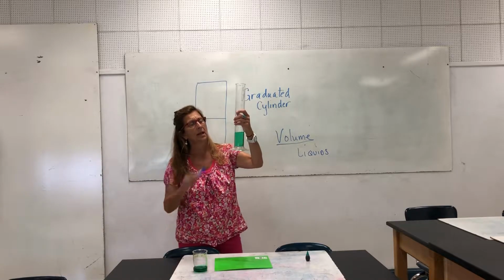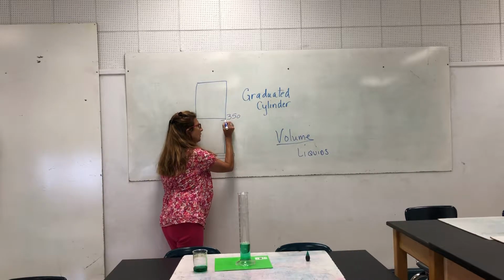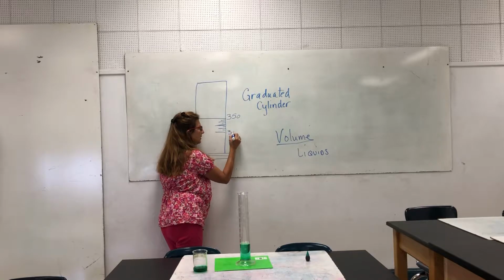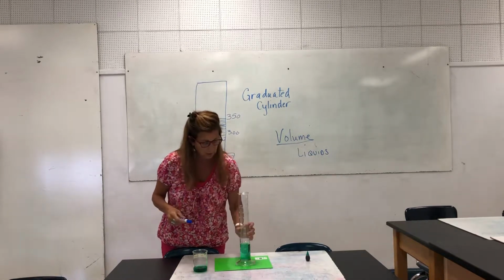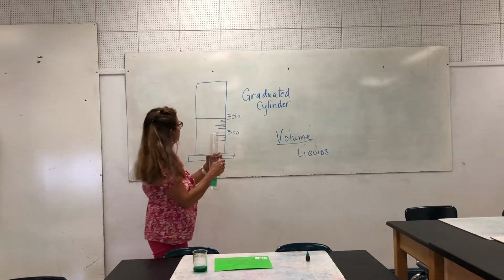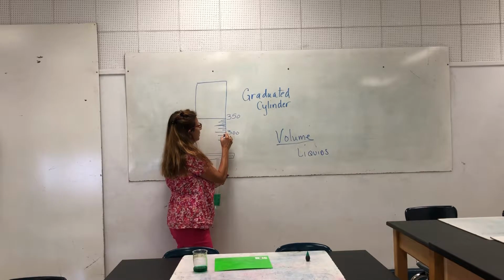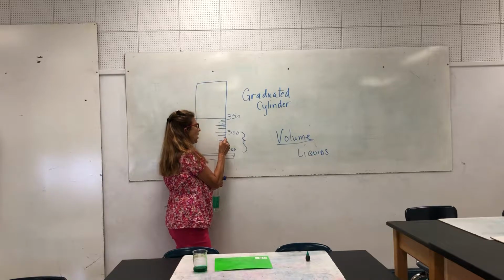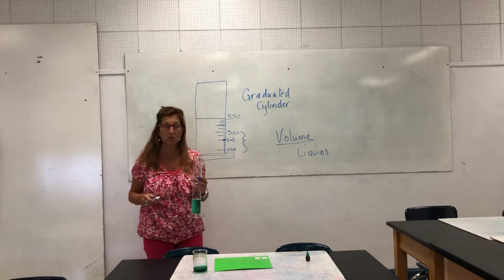I'll give that a second to calm down as we pour it in. I'm going to show you on my board back here, as we pour things in the cylinder, we're going to find out there's a lot of small marks called graduations. And in most cases, there are groups of 5 or 10 marks between each of the major numbers that might be on this cylinder. In this particular case, between 350 and 300, we have 10 marks. Between 300 and 250, you see, you got 1, 2, 3, 4, 5, 6, 7, 8, 9. Then we have 250. And so each of the marks on the side of that cylinder would be equivalent to 5 milliliters, since there's 10 total marks.